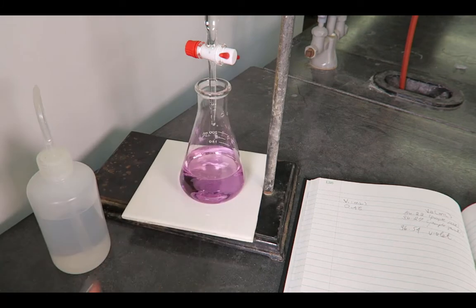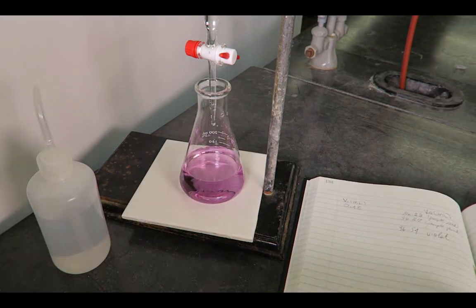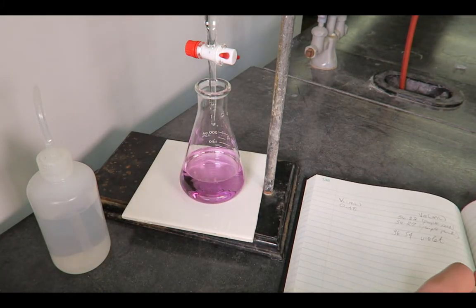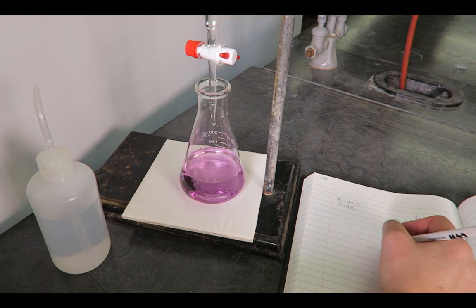When the color of the indicator first begins to change, titrate drop-wise, stopping frequently to wash down the walls of the conical flask with deionized water.